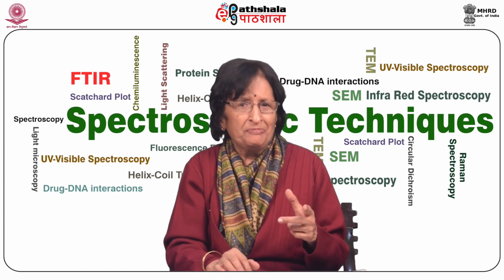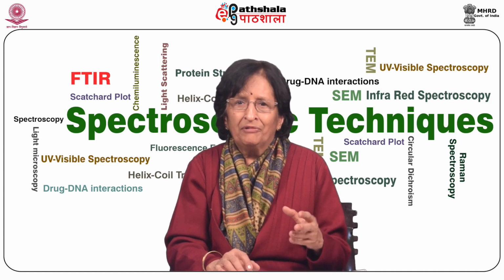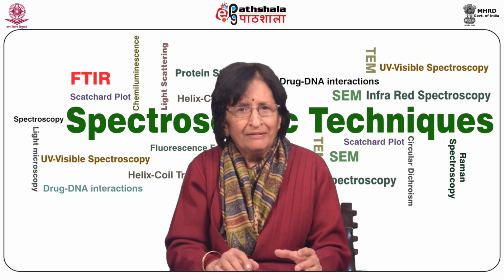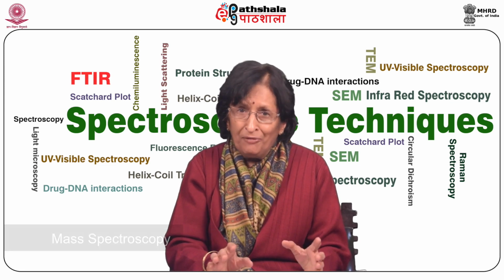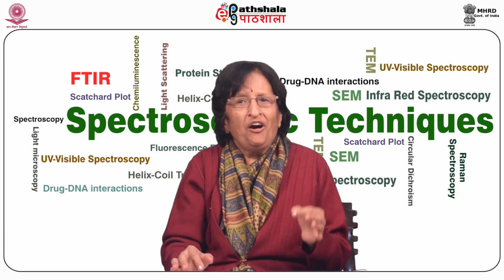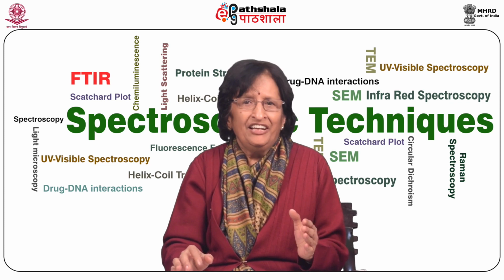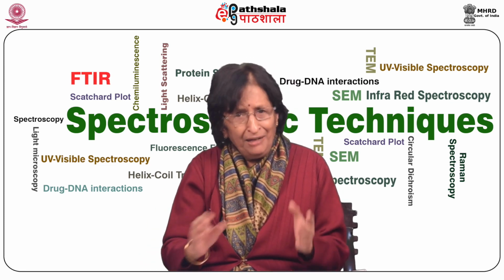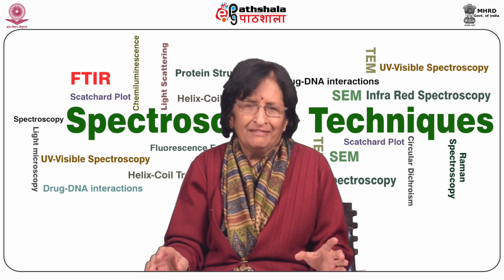It is also possible to use mass spectroscopy to do the same job of discriminating the elemental composition. However, although mass spectroscopy usually gives better results, optical spectroscopy is more common. Why? Because of the cost effectiveness and performance adequate for many routine tasks.